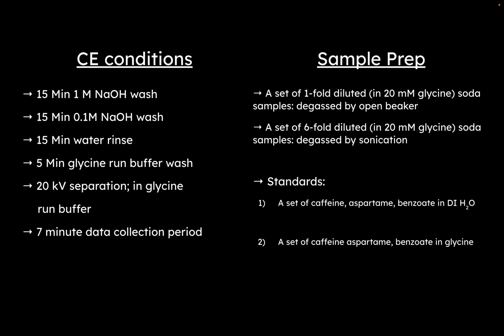So I actually did find a sonicator, despite someone telling me that there wasn't a sonicator, which was really nice. In my next set of trials with samples, I did the 6-fold dilution. I degassed them by sonication, and the results we'll see came out a lot better. I'm going to go through both, but I just wanted to make you aware, because this can be a big point of confusion if you don't get it.